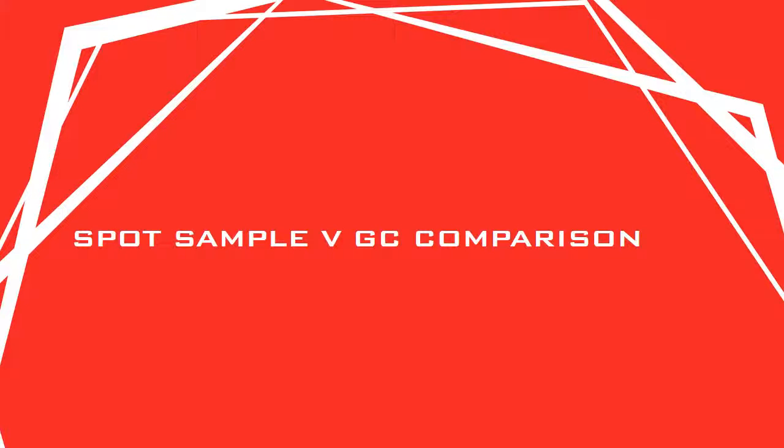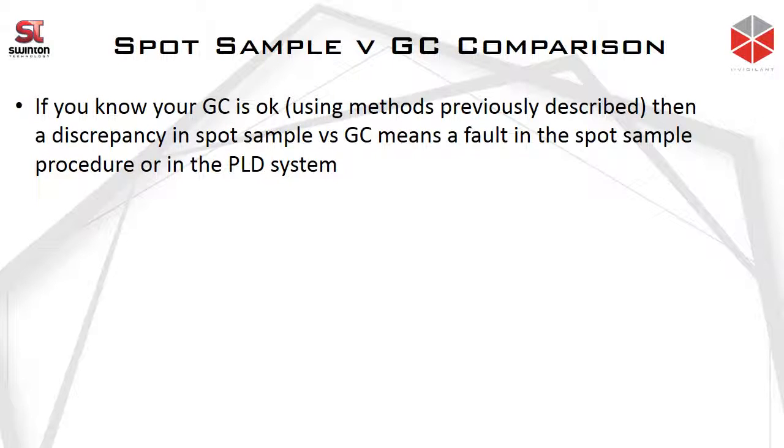Now I just want to introduce how useful doing a comparison of the spot sample analysis to the GC result can be. We've seen some methods described in previous GC Surgery sessions on how to know that your GC is healthy to begin with.